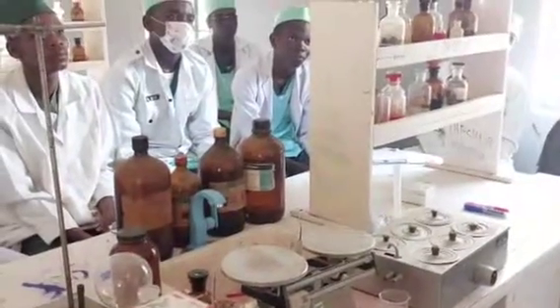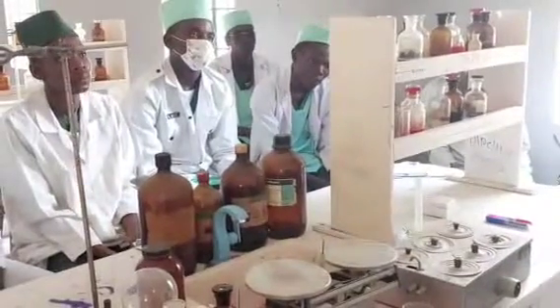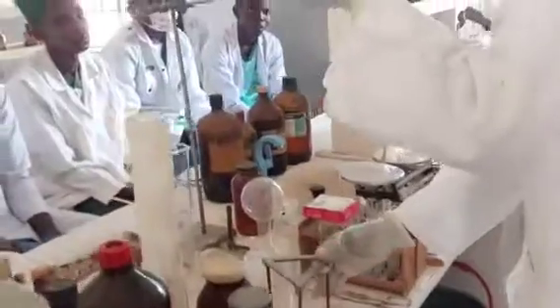Maybe the chemical you are using or the reactants are flammable. You don't use open flame. Then this is our tripod stand.